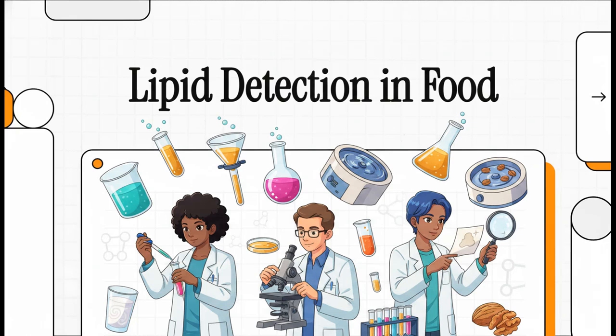Welcome to This Explainer. I'm Dr. Chem, and today we're putting on our lab coats to explore the fascinating science of lipid detection. We're going to see exactly how scientists isolate, extract, and analyze the hidden fats inside our everyday foods, from a simple glass of milk to a handful of nuts.